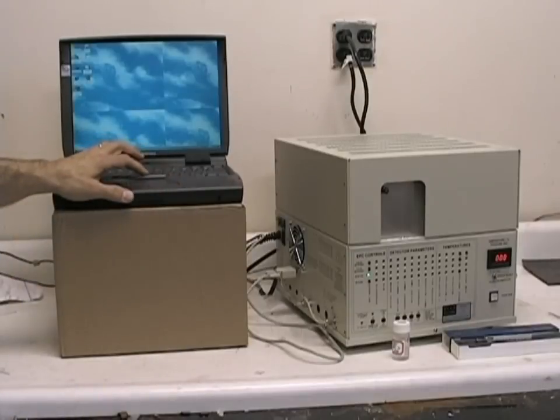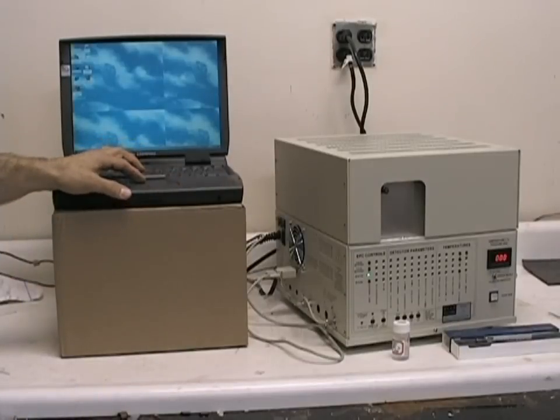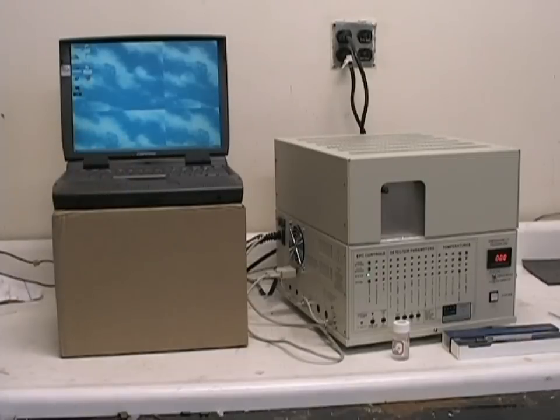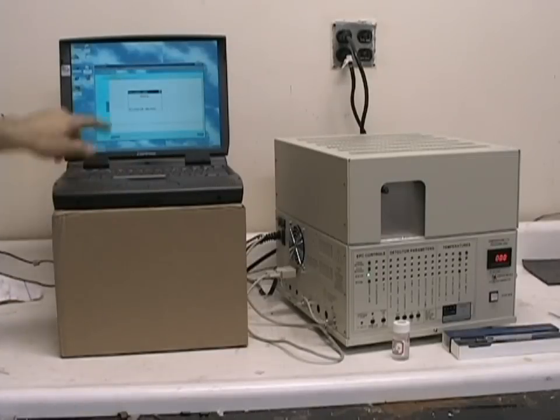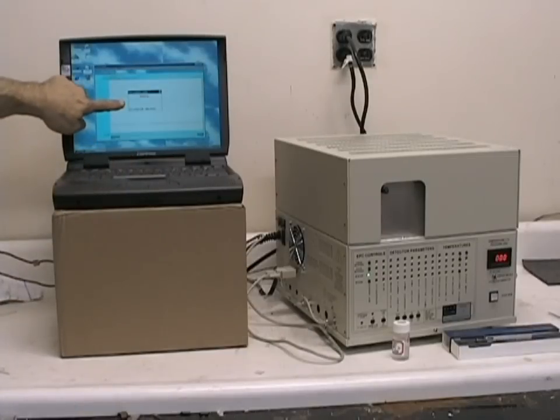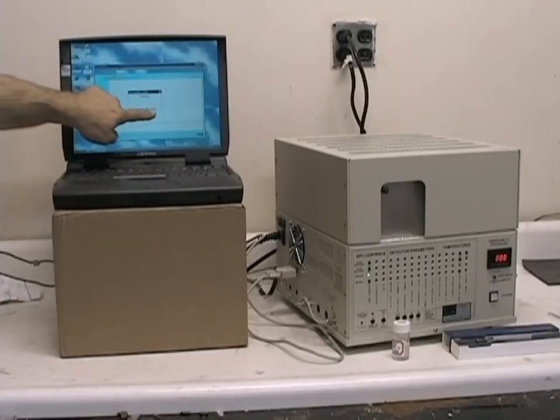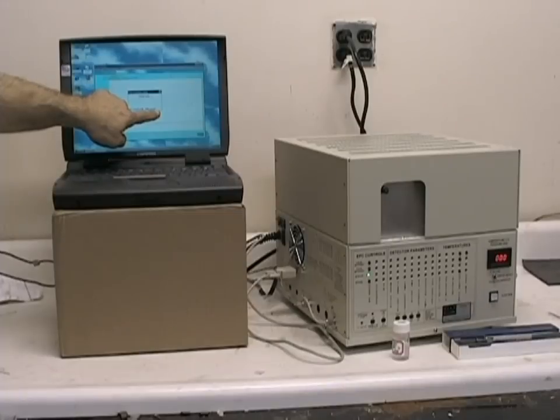At this point, we can double click on our peak simple icon. The system will initialize and establish communications between the hardware and the PC.